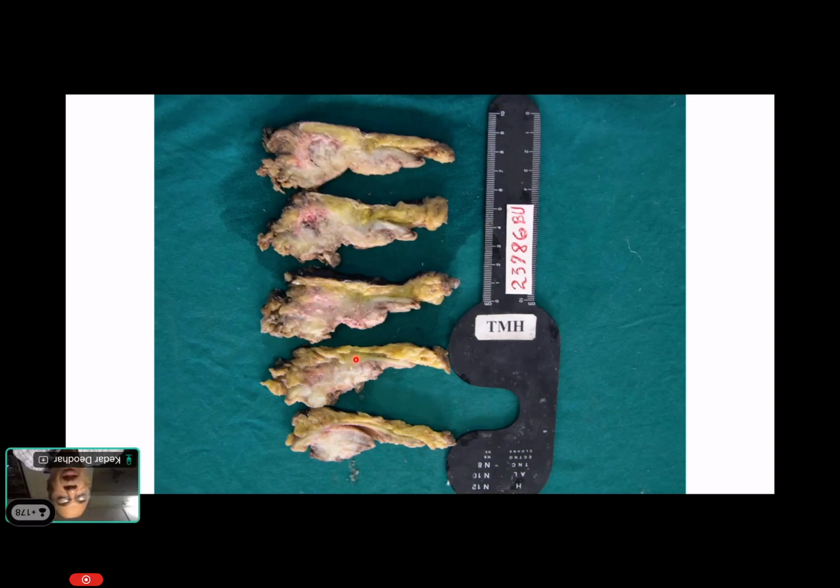but suffice to say that this is what I will do. I will lay the multiple slices on the table and look for the area which is deepest to your CRM, and select a block from this area, this area, this area, this area. So select a block from the area which is going to be the deepest, because we need to measure the distance on the slide.